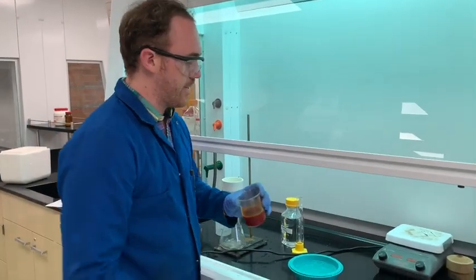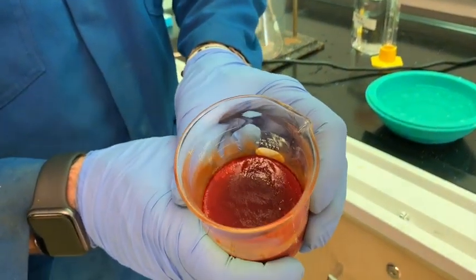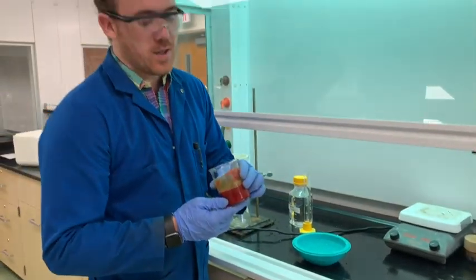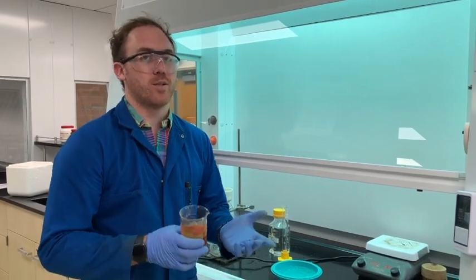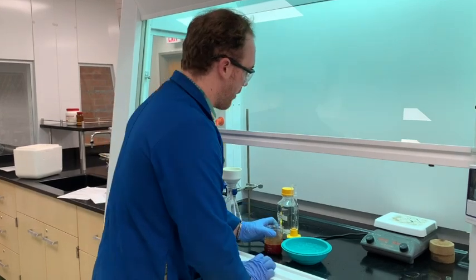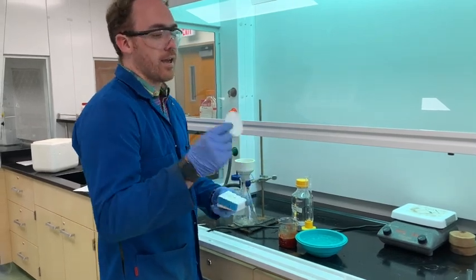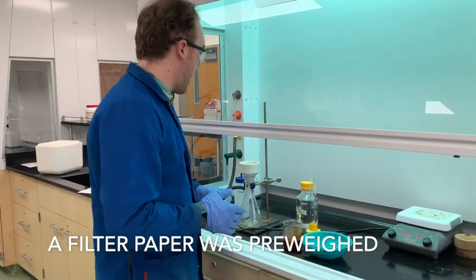Alright, so we have taken this product and we let it cool and actually solidify. The entire mass here is all solid. So I think that we probably have some extra water in there. It usually takes a longer time to dry. This product loves water. But that's fine. We have a vacuum filter, really good for that. So the way that you're going to use this vacuum filtration apparatus, this is a Buchner filter, is you're going to take a filter paper and we're going to pre-weigh it.